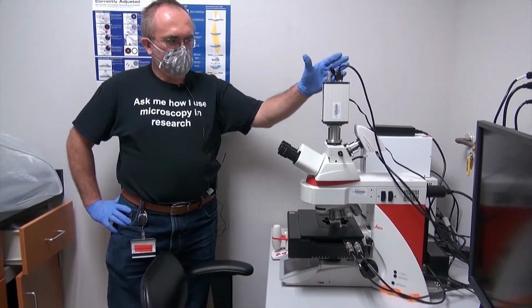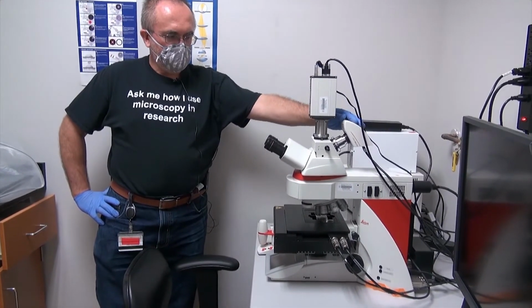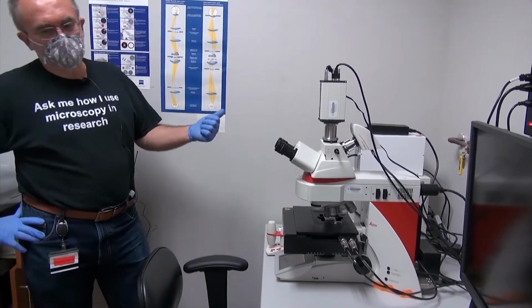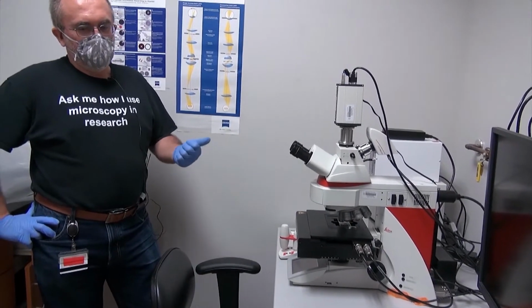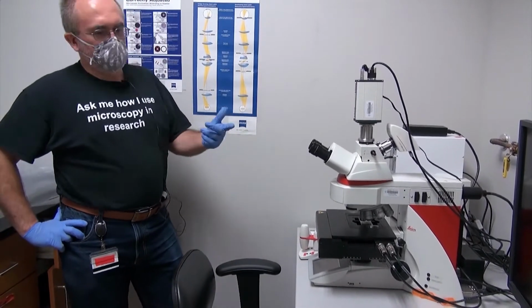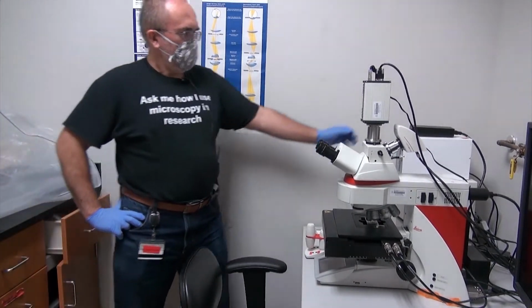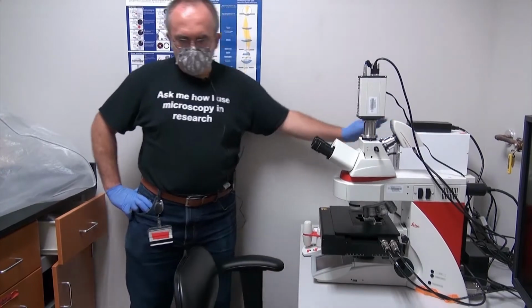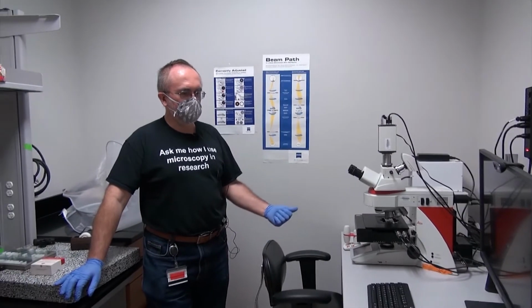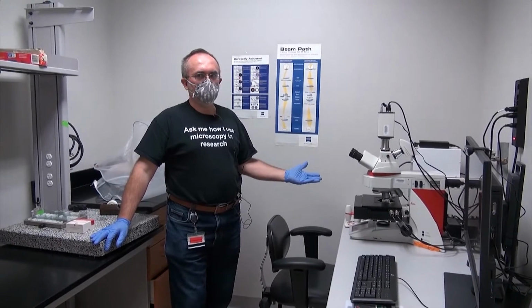It has 2 cameras, a monochrome high sensitivity CMOS camera and a color camera. It's got motorized filters, and the filters cover most of the common dyes or fluorescent proteins in the visible spectrum, from DAPI down to dyes like Cy5 at the red end of the spectrum. It has an LED light source for fluorescence, and besides fluorescence, we can also do transmitted light imaging either in bright field, phase contrast, differential interference contrast, or in polarized light.